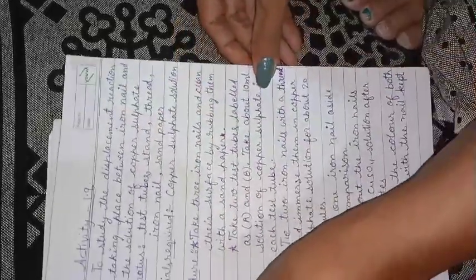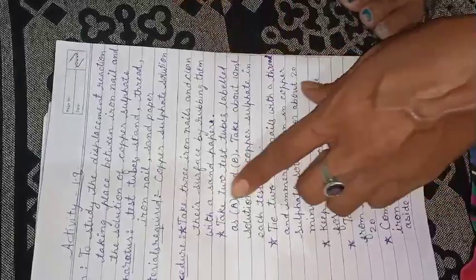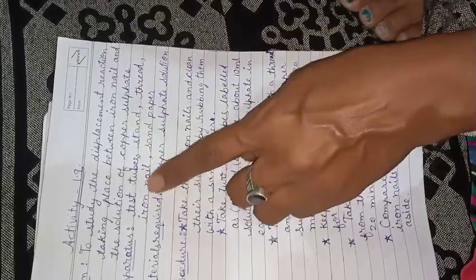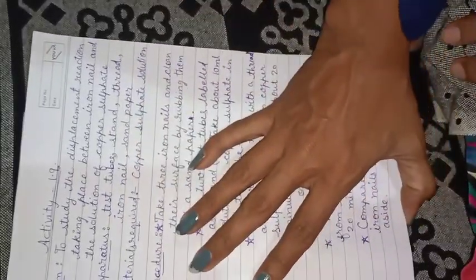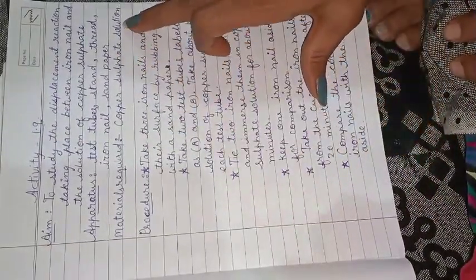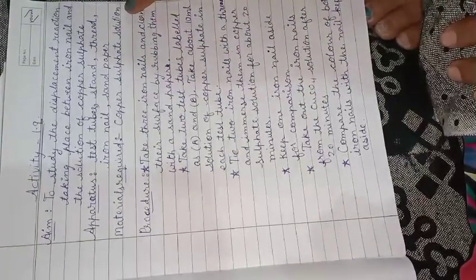In this displacement reaction, which kind of apparatus do we have to take? We have to take test tubes, stand, thread, iron nail, sandpaper. And which material is required? We require only copper sulfate solution.